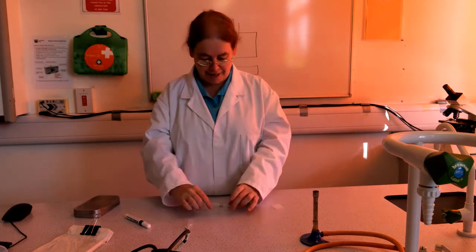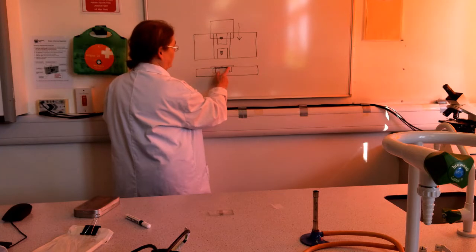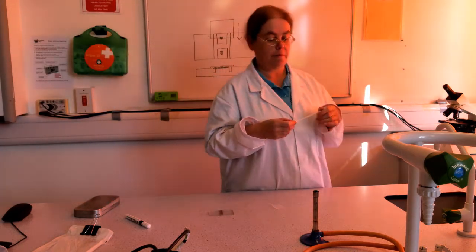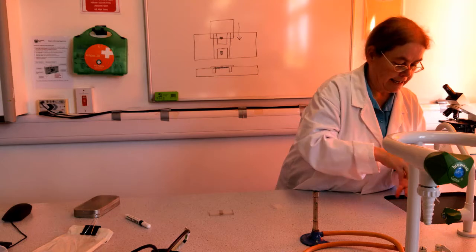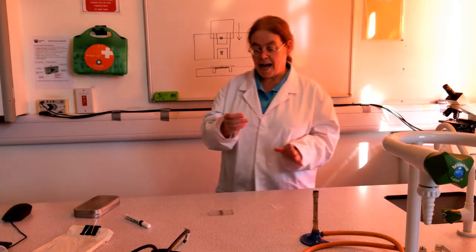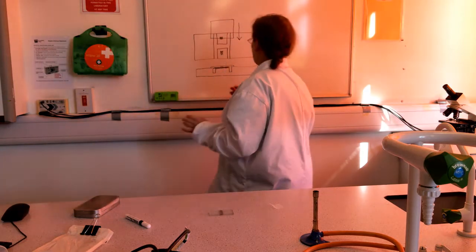Right. Anyway, that's stuck. Now I need to fill this space that I've coloured black with my sample, which would normally be my bacteria. In this case, I'm just going to use some water. Again, I'm not troubling to be sterile. And so how on earth do you get the water on when you've already got the cover slip on? It's actually easier than it sounds.